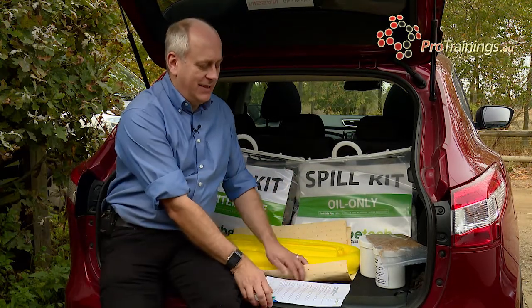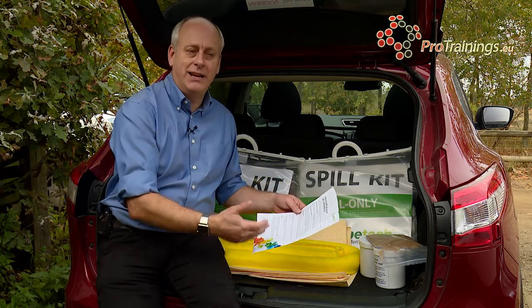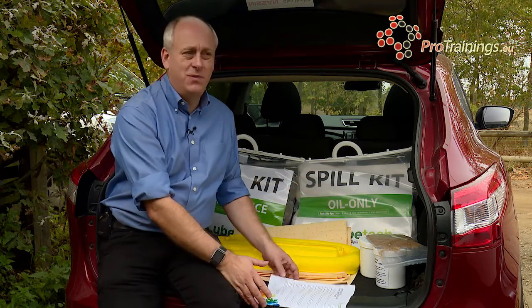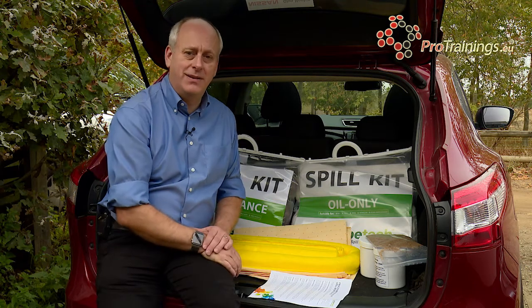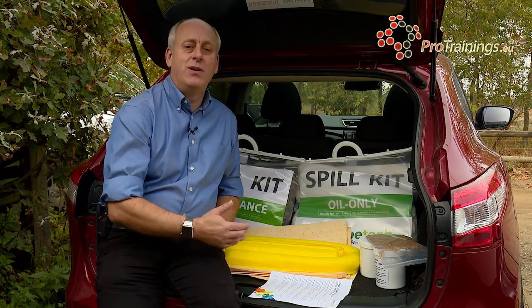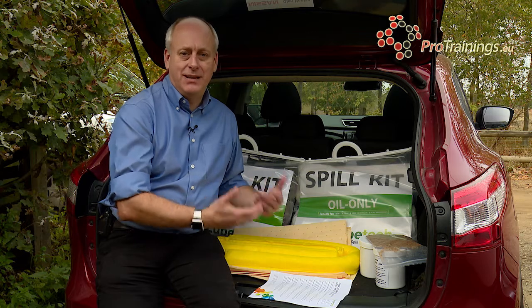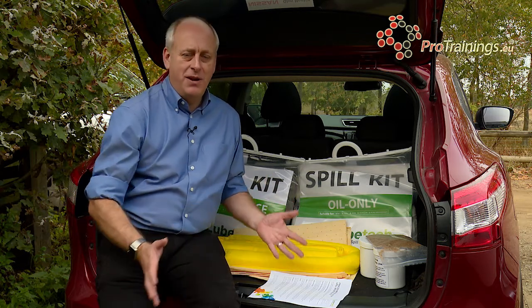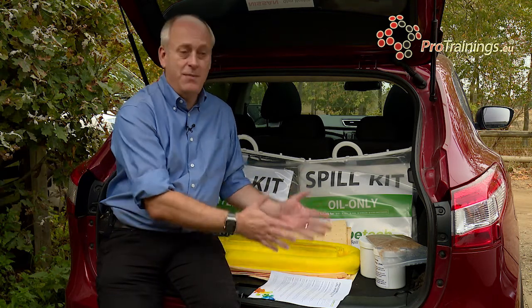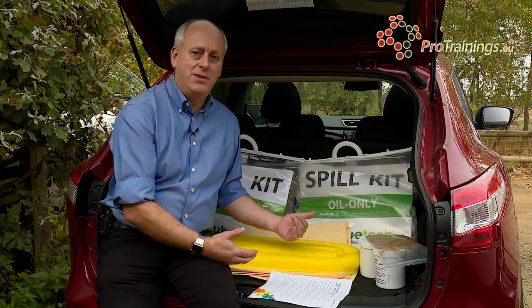Inside the kit, the first thing you will see is an instruction leaflet, which will tell you some information about the spill kit and what it can actually do. All of them will be slightly different — different makes of these kits — but they all have very similar types of components. The first thing to remember with any chemical spill kit is your own personal safety. You would always need to make sure you are wearing full PPE: gloves, a respirator, overalls or any other clothing needed to keep yourself safe from the chemical itself, and also from any potential dust or vapours that could be given off.